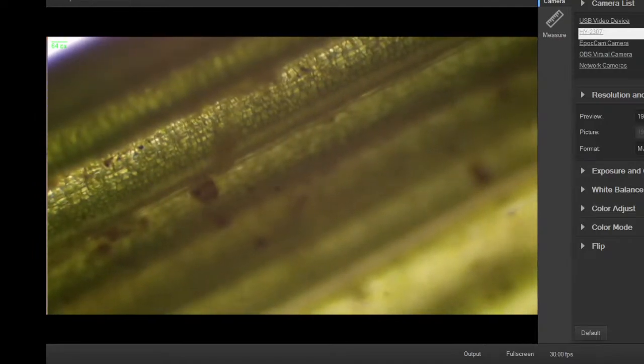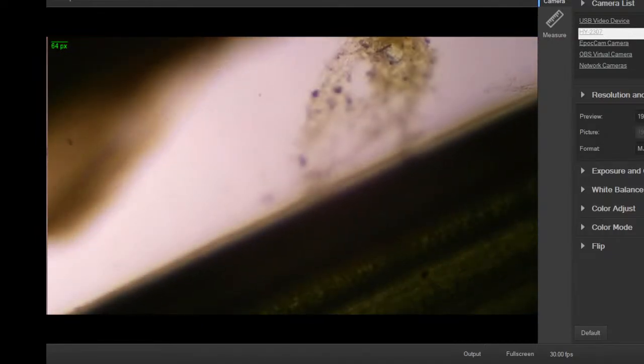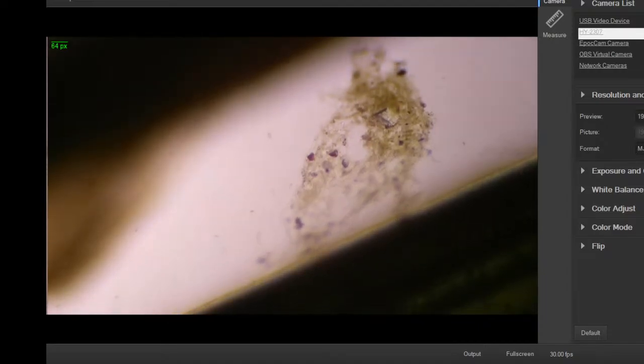So they can do inchworming behavior, they can do free swimming. They can also attach that foot that's used for the inchworm motion on a structure and just sit there and pump away these structures at the top of the body, essentially the head, and suck in all kinds of particulates, filter feed, just like a clam or a mussel does. Just these guys are very tiny. Like I said, they're about 1,000 cells.